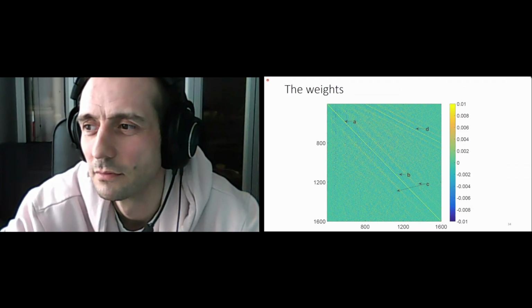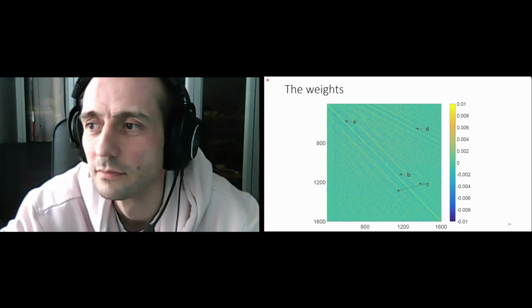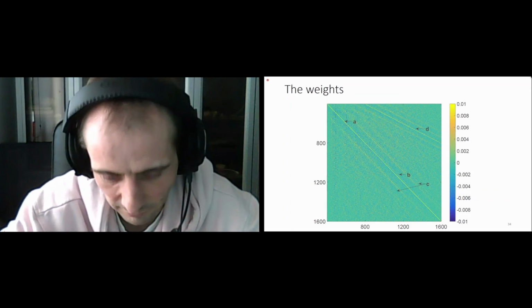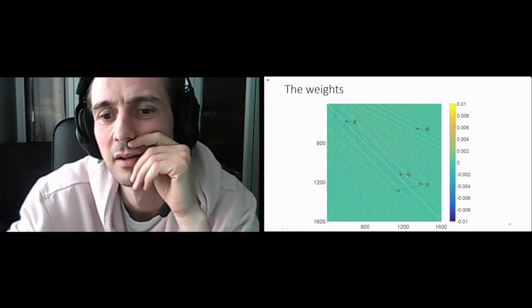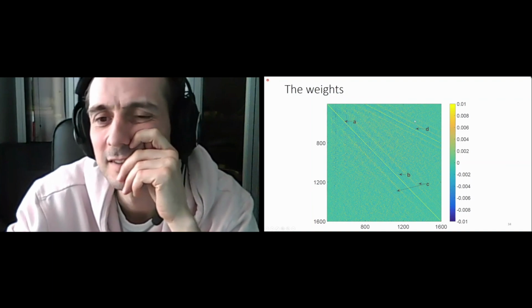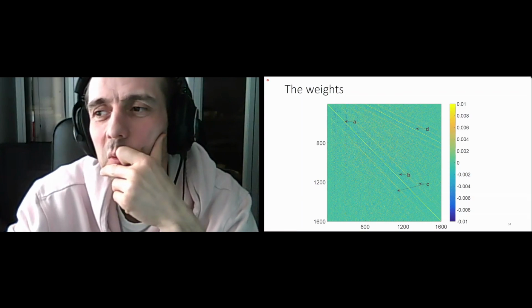And then you also mentioned that you can use convolutions here. So this basically restricts your matrix. There is some additional structure, which, as far as I understand, leads to a matrix with constant diagonals and a very sparse matrix also. Yes. So basically, the convolutional layer goes over this part, right? Exactly. But you cannot model this skew diagonal part in this case, right? Yes, that's correct. So maybe you can combine somehow. What is it, strides or something like this?